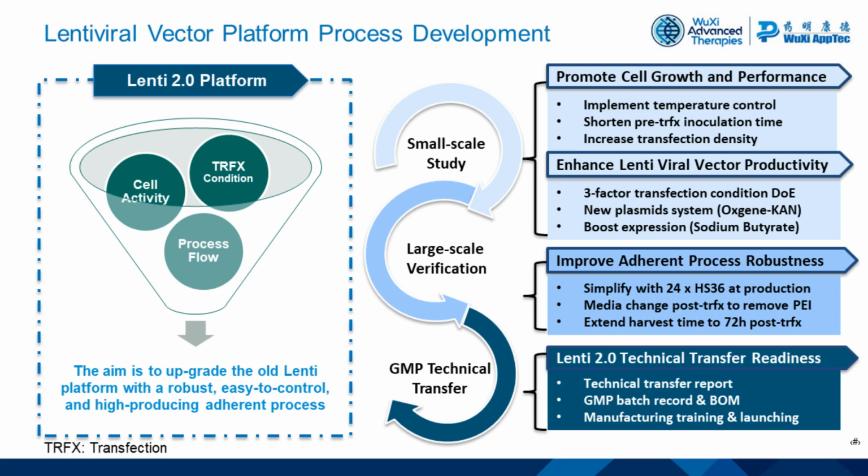Finally, we executed the technical transfer and onboarded the new platform in the GMP suite. At this point, all the GMP documentation has been completed, and the new Lenti platform is fully ready for use to support client projects. In the next few slides, we will show you some experiment data, the improvement we achieved, and what the final GMP process looks like.